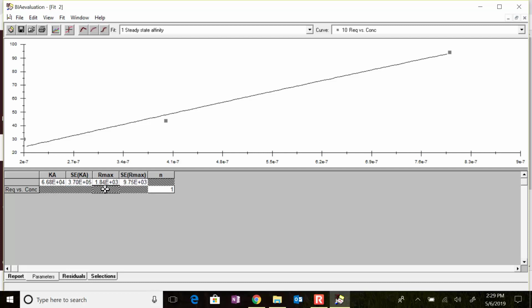Okay. Now in this case, can you tell me one issue I might have with my standard error? The standard error is times 10 to the 5th. The Ka itself is times 10 to the 4th. Kds are a little bit weird to deal with because they're reciprocals and they're negative logs, but Kas are actually simpler to look at, and you can see that my error is bigger than my value. Okay, so we have to go back, and maybe I can find a way to fit in the other ones. Maybe I can make this replicate work.